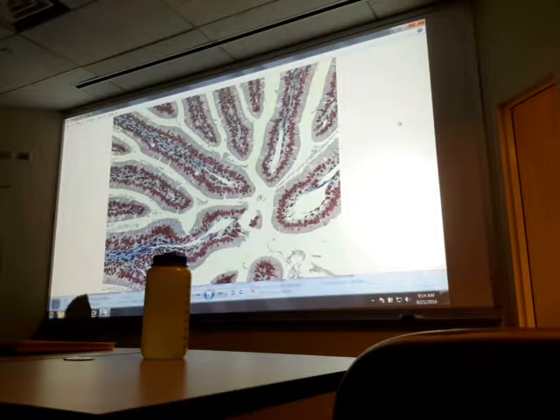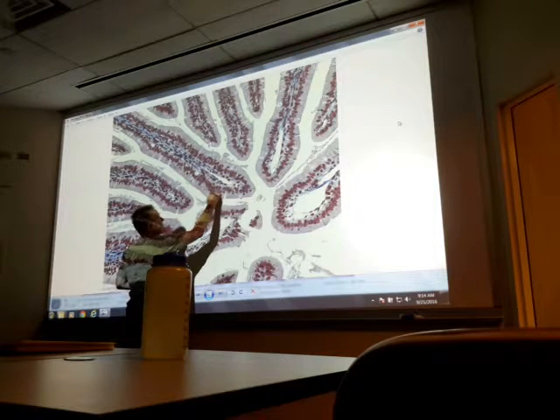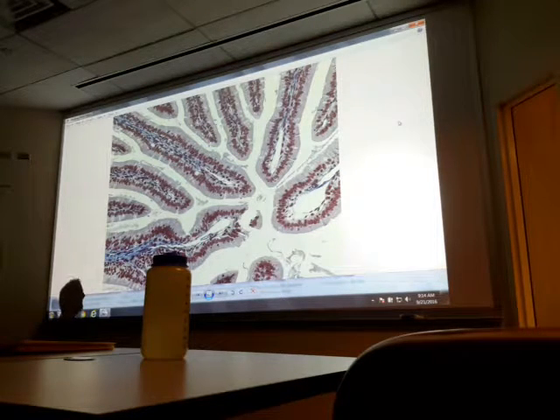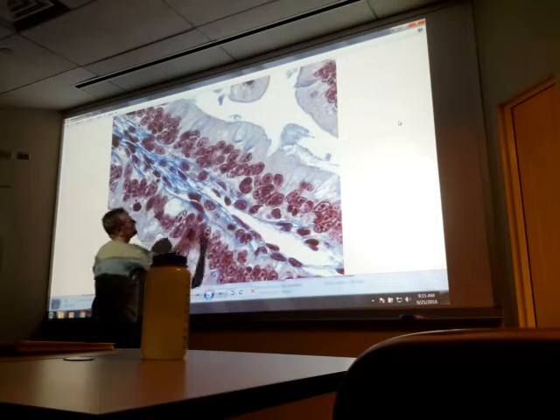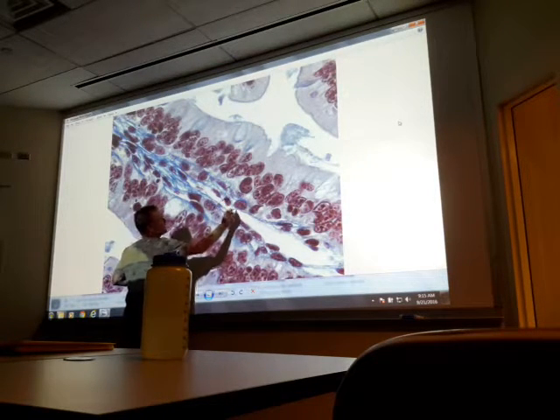So now we see a few villi. When we get to this magnification, we only see 2 of those layers, what I called 1 and what I called 2. And again, I'll name those layers a little later for you. We blow it up still further. All of this is layer number 2.